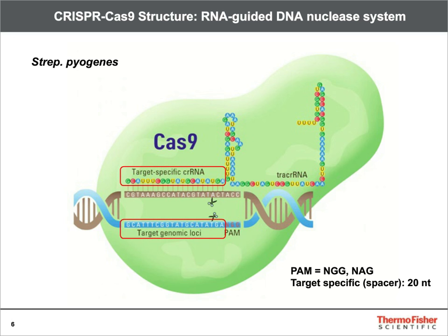Once the Cas9 guide RNA complex finds the respective target loci containing the suitable PAM site, the Cas9 molecule induces a double-stranded cleavage. Thereafter, the cell repair mechanism is leveraged for editing, either using the non-homologous end joining repair mechanism or the homology-driven repair mechanism.